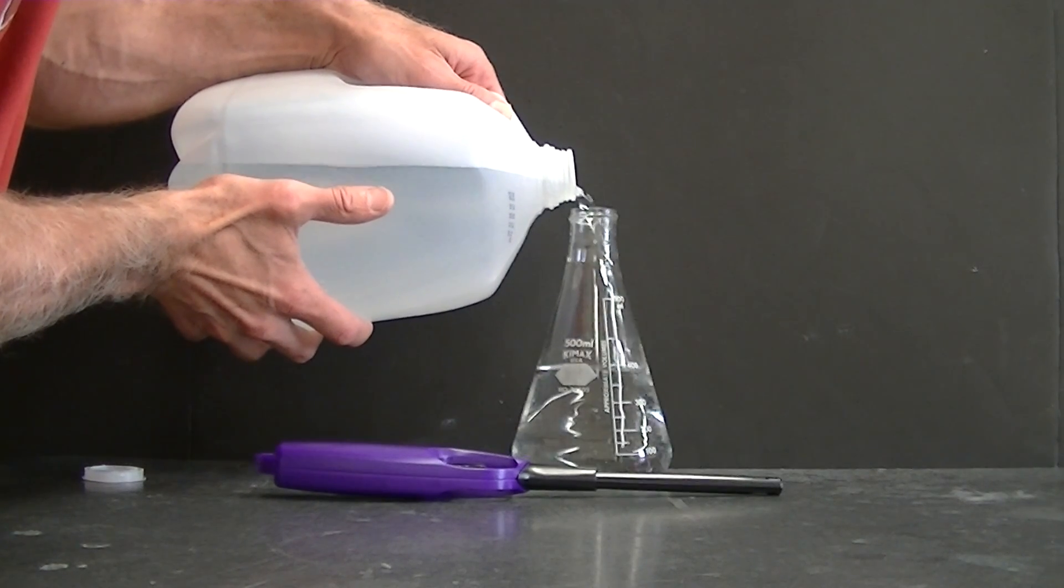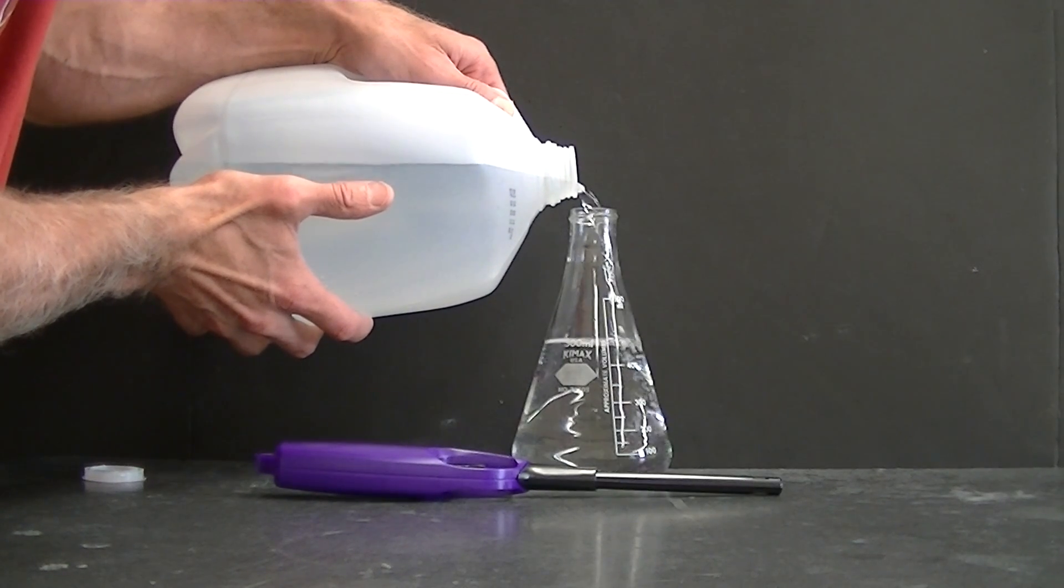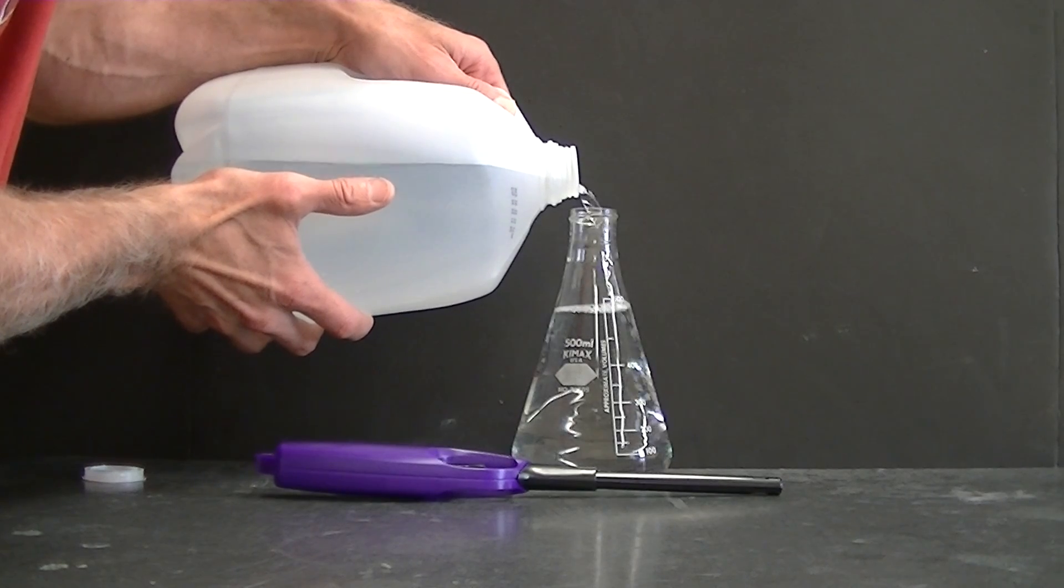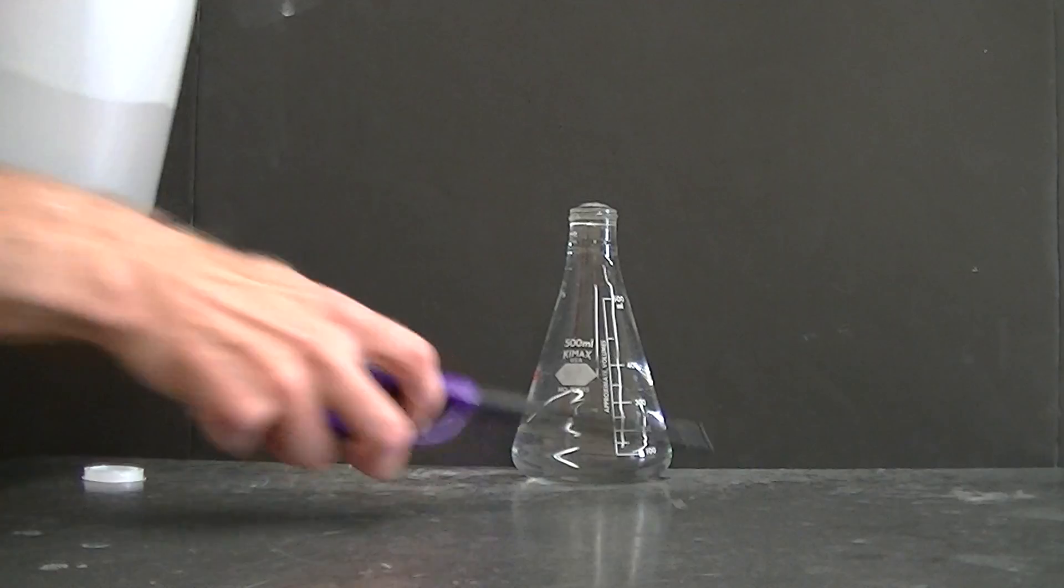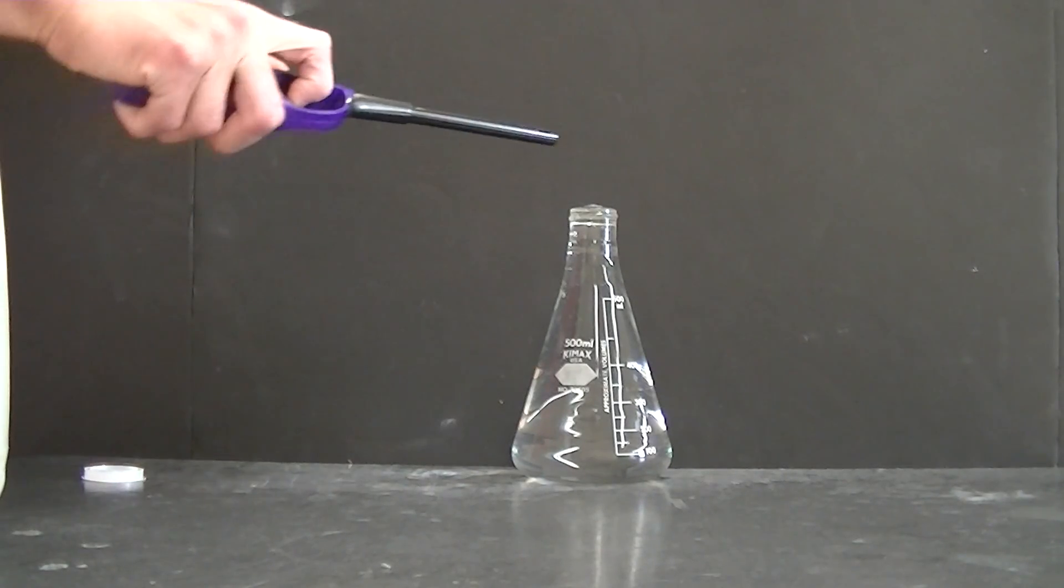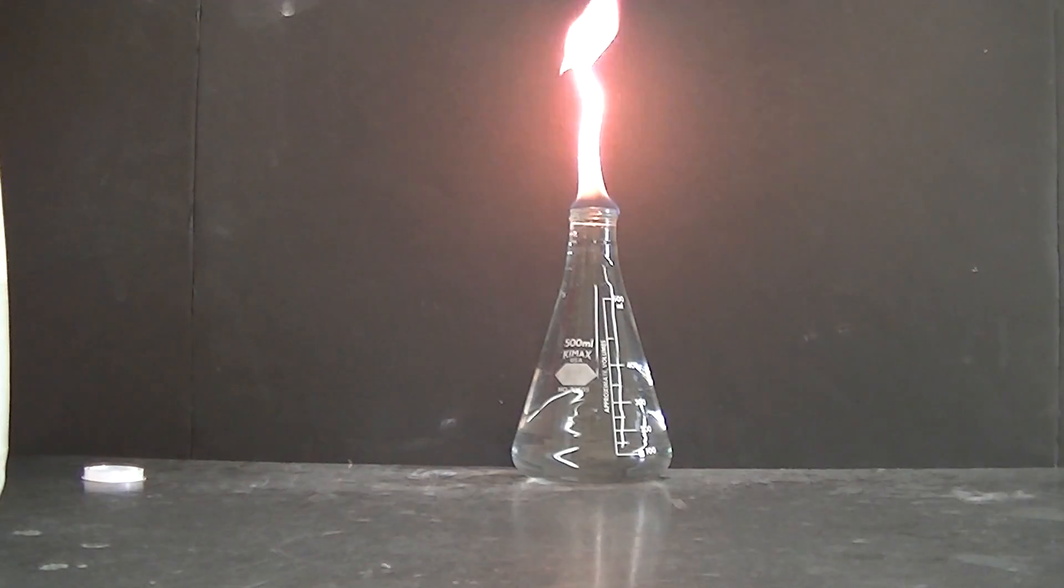The hexane layer floats on top of the water layer because it's less dense than water. You fill it all the way to the top, and because the hexane layer is on the top, it can be lit on fire.